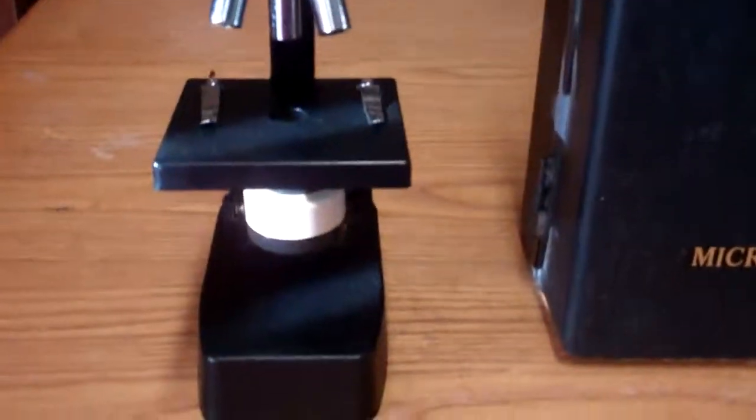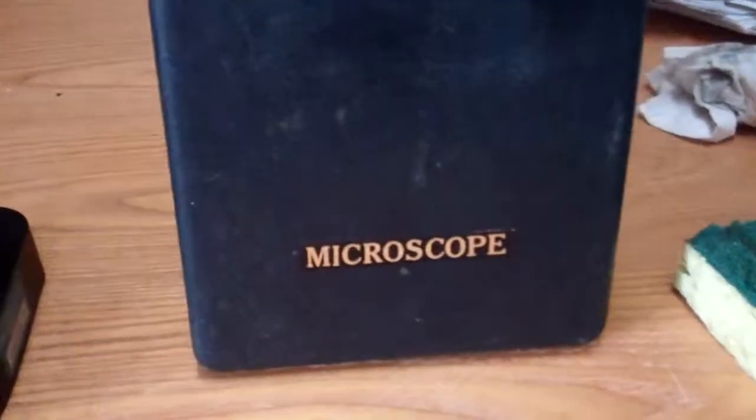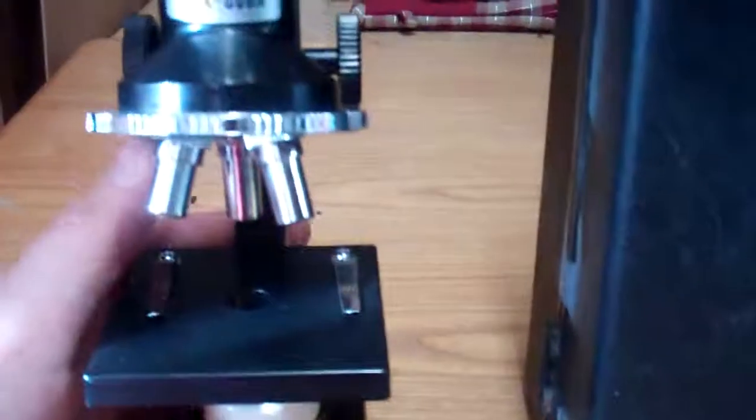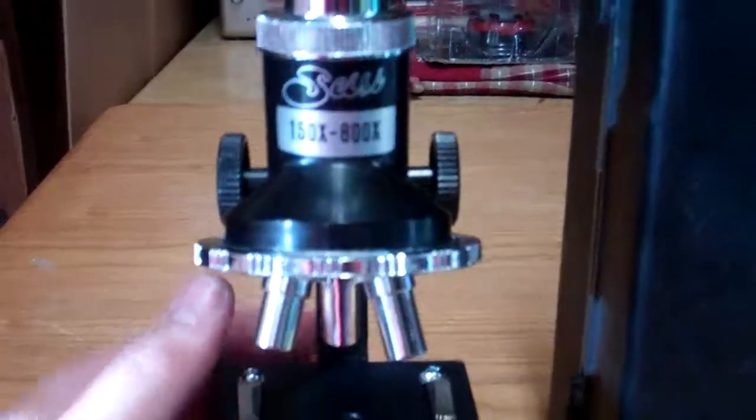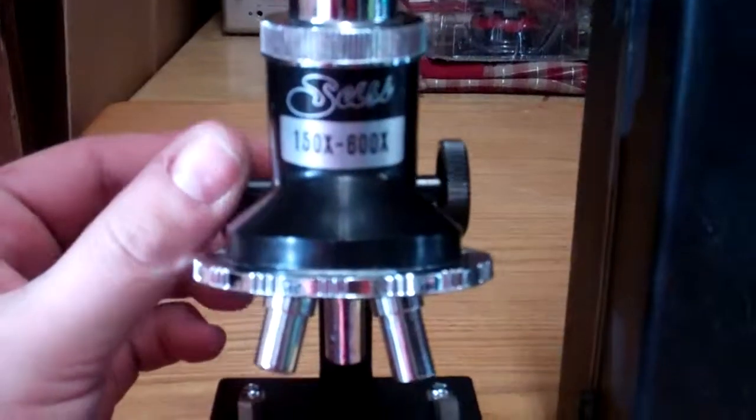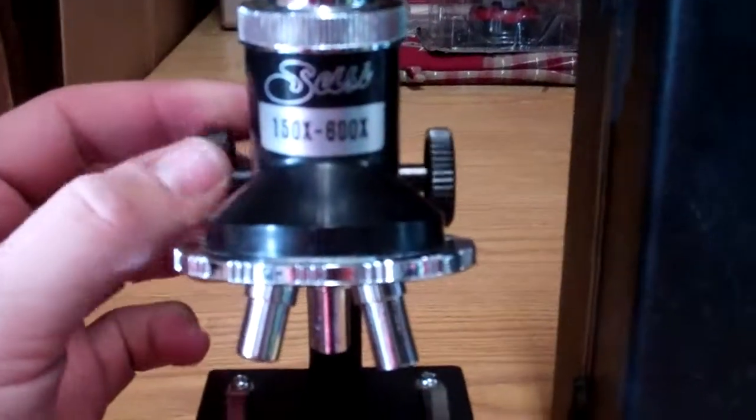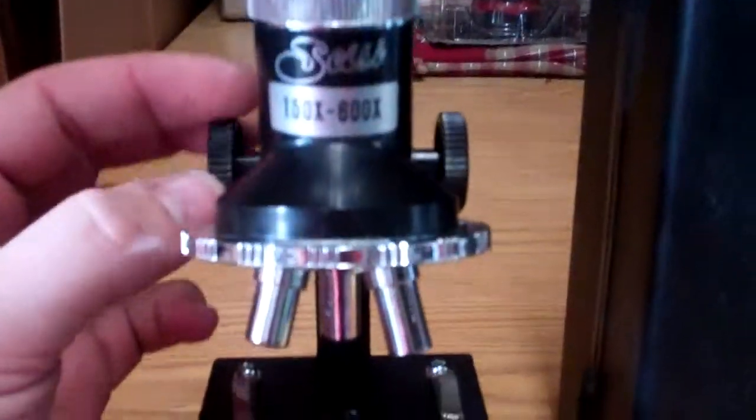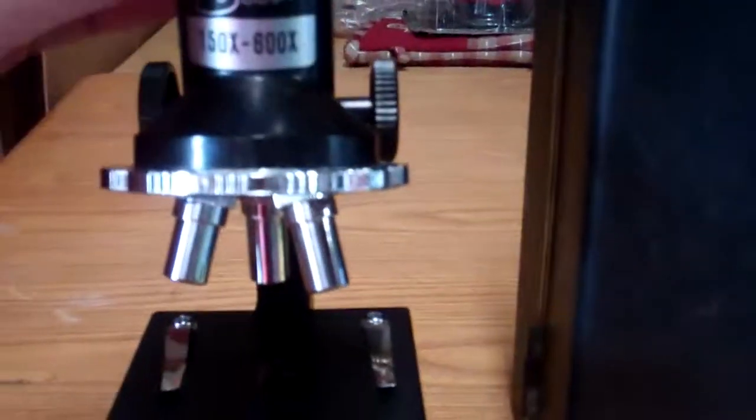Alright, how are we doing today Ebayers? What we have here is a microscope. It zooms from 150 to 600.